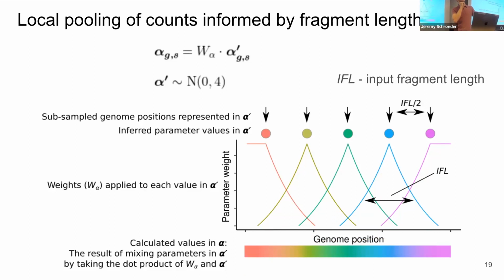And the reason I do that is because I think there's a certain probability with which, if you have a certain fragment, you don't know where the protein exactly was bound along that fragment, but it was probably in the middle. So we could split hairs over whether it should be Gaussian, or Hamming, or Laplacian, whatever. But I've chosen exponential, because it makes sense to me to consider there being an exponential decay from the middle of some signal.